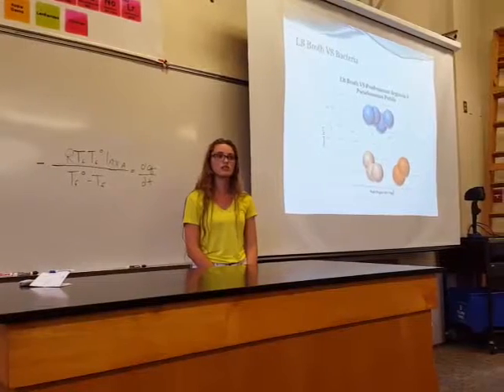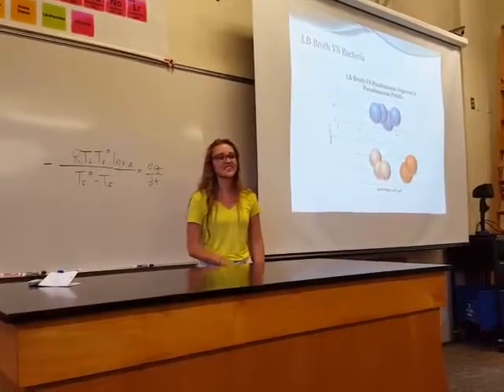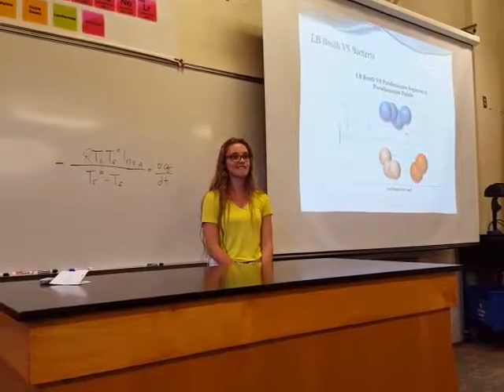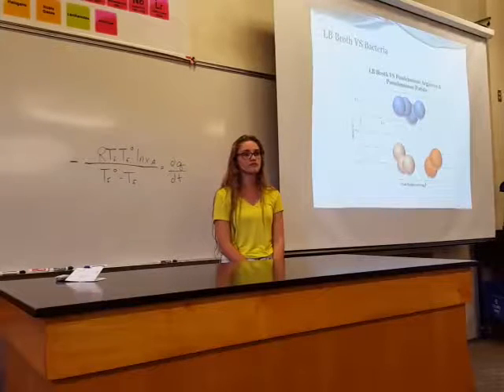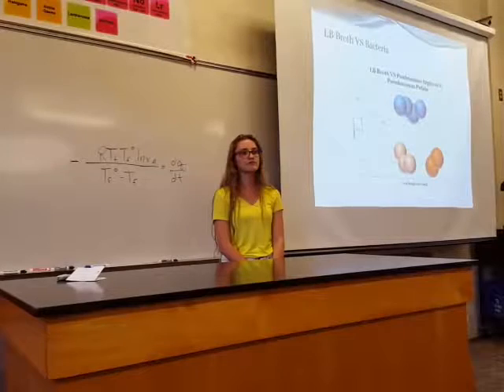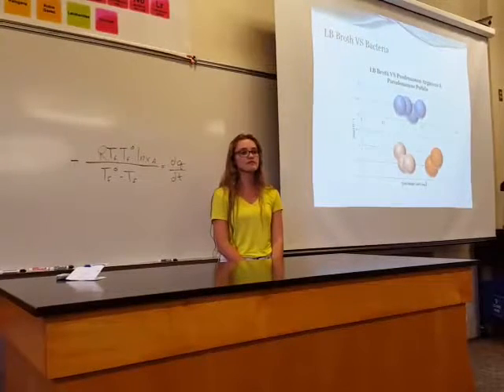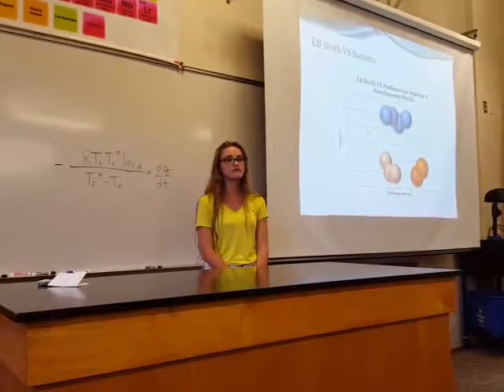It's a sealed, closed system. It shouldn't... Yeah, it should. The larger your sample, so what you're saying, you're filling up the entire crucible with that 40 microliters, and it's trying to freeze, it's trying to expand, you're putting it under pressure, and so you can lower freezing temperature by changing the pressure. So it's not just supercooling, you're also pressurizing it too.